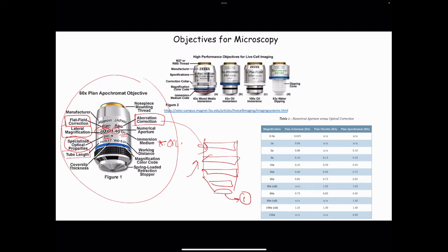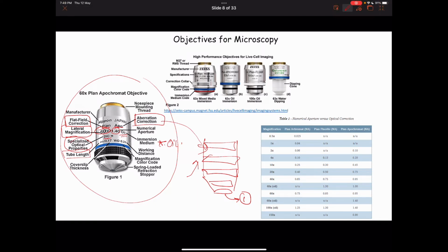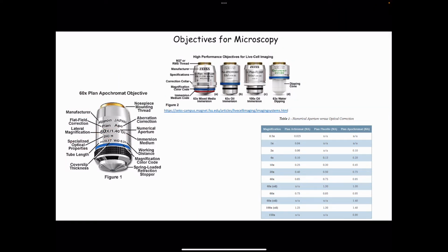And in order to recognize that purpose, we want to know first why they are needed in the first place. And for that, I'm going to make another video. It's not a topic for this discussion. So we'll continue with what other markings are there. I think there is a working distance here, which you can see. It's basically, I think, in millimeters, or nanometers, I think.